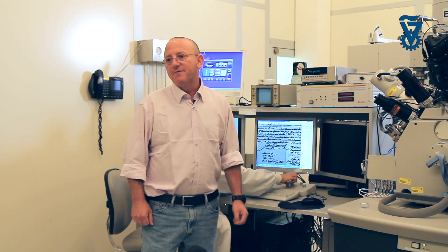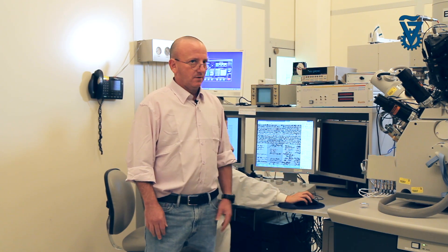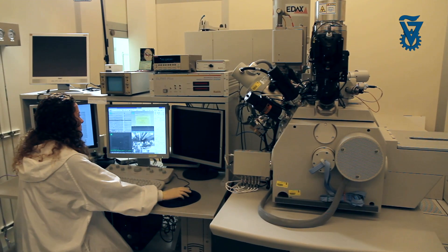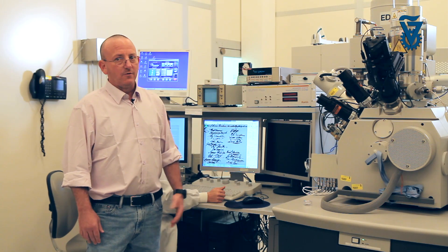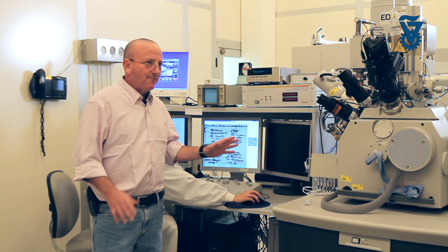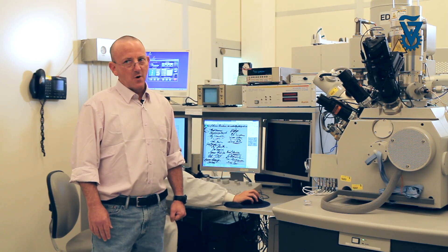This dual beam FIB is the first system of its kind ever installed in academia in Israel. The Technion is a leader in electron microscopy and ion beam microscopy in Israel. It was established as an independent laboratory as part of the Russell Berry Nanotechnology Institute here on campus, and we are very grateful for this bequest, which allowed us to purchase this equipment, installed in a very special configuration, enabling the kinds of experiments we are doing here at RBNI.